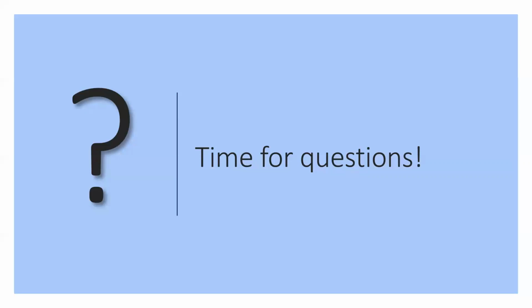Are there any configurations that can make the female and male variables invisible? We will have the option to hide the female and male in the future. For the time being, you can use the permissions and prevent a user from changing the columns. So he will only be able to see the columns that he has, and will not be able to change them or add any columns. If you want to know about specific cases or to create a specific permission, please contact us at Phenom at openacase@phenomnetworks.com.